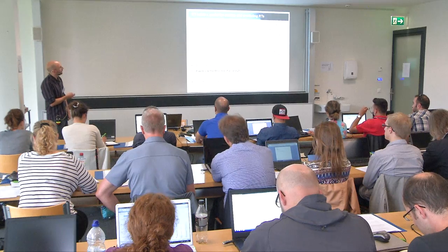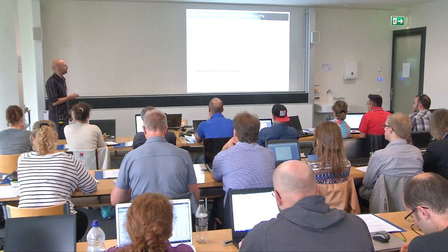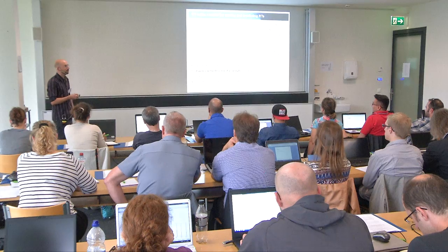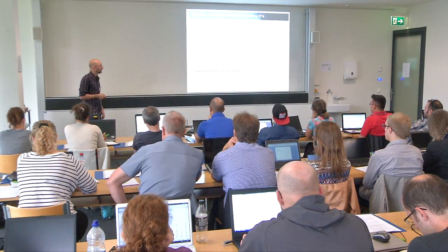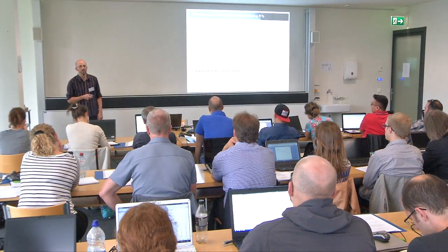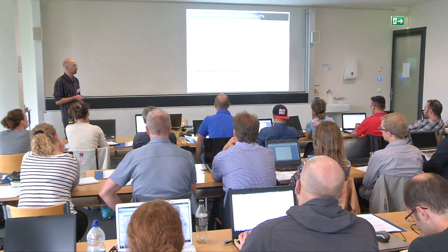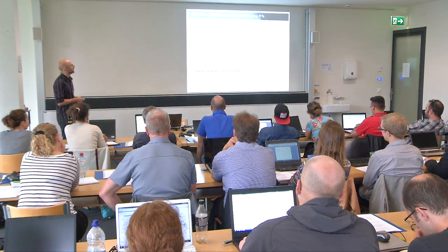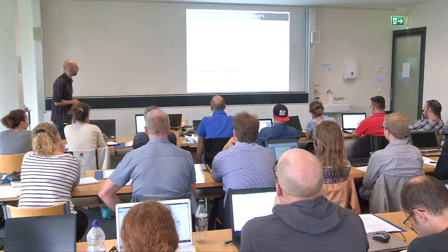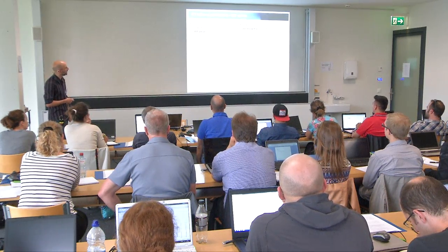Here we called it retention time index, and that is the fact that we're going to index retention times of analytes in relationship to standards. And in proteomics, quite often, or the term that we use most commonly, but there are certainly other terms, is an IRT value, and some call it independent retention time or index retention time. We're actually never sure what the real meaning of the I is. Maybe it's just iPhone, but the point is that it has a bit of a different name, but it's the same concept. So how would the IRT values work in proteomics?